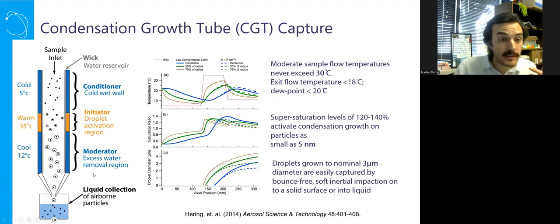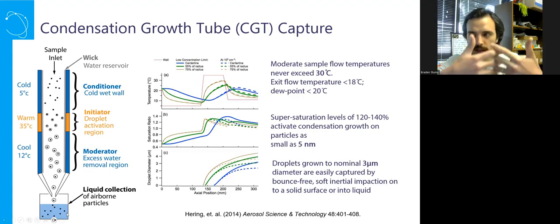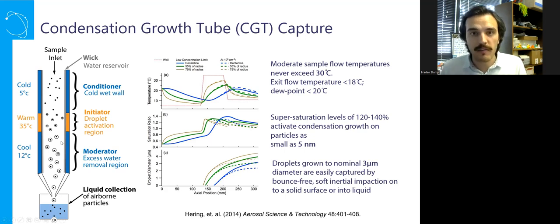There are some huge benefits to this. The first being, with this blanket of water around the particles, you are getting really pretty gentle impaction. So when it actually hits the surface, that bubble of water around it is taking a lot of the stress of impaction. You don't have to impact it as aggressively because you have this large droplet around it that will allow you to impact properly.